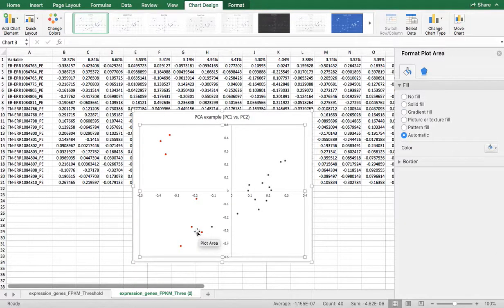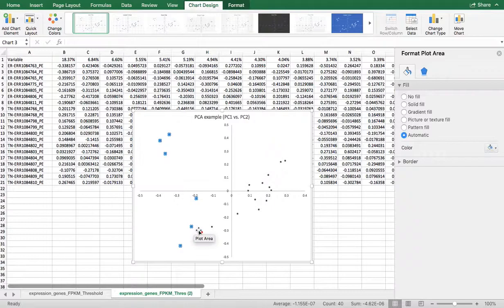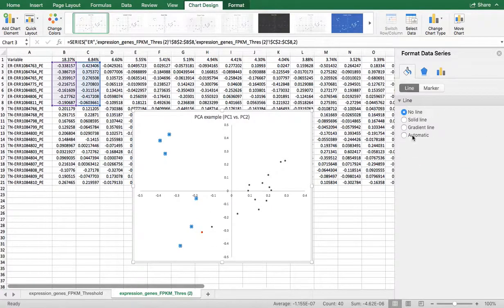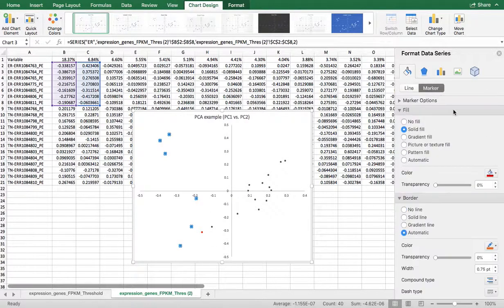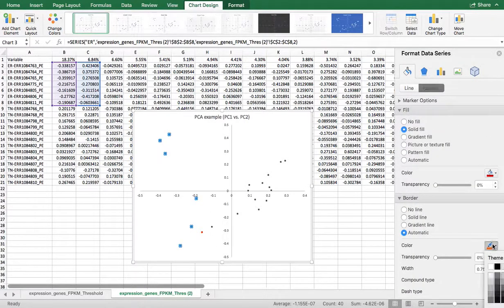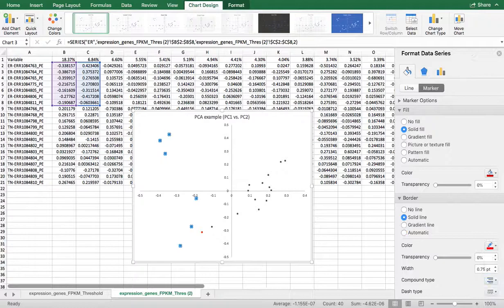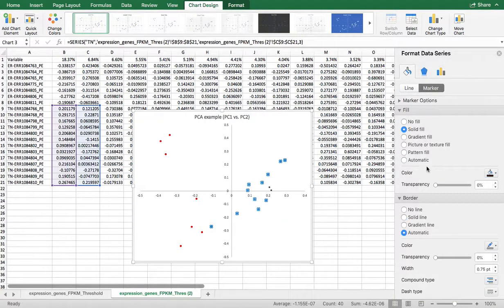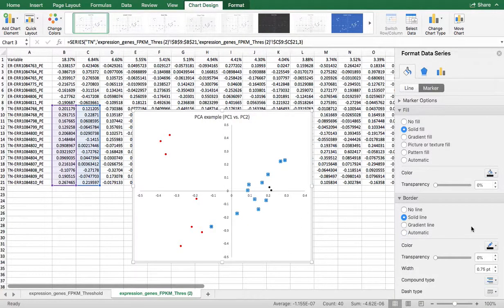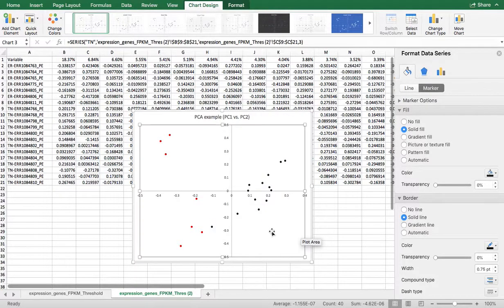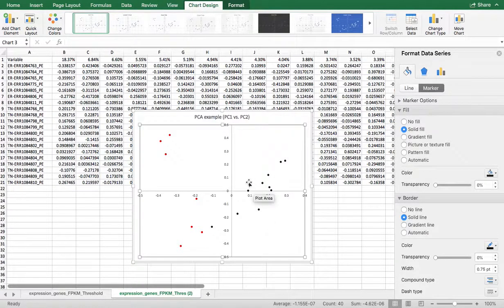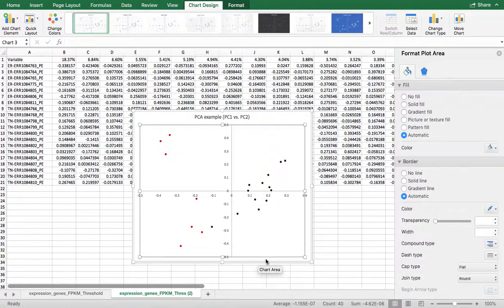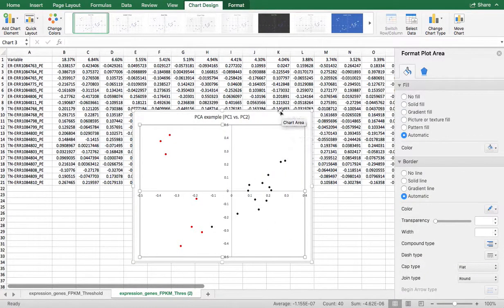Unfortunately, I also have to change the border. I'll also change that to red. I'll also take this and change this to red, to dark. Now we've got a very clear picture of what's going on.